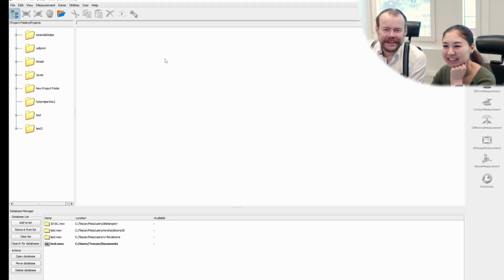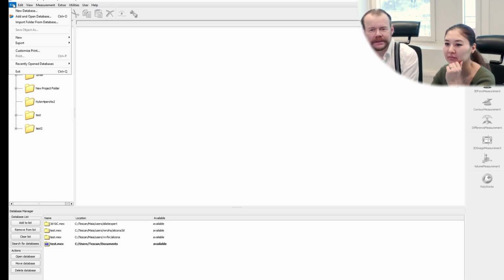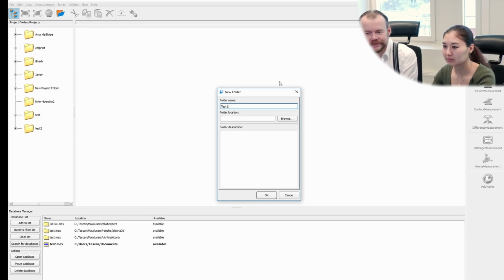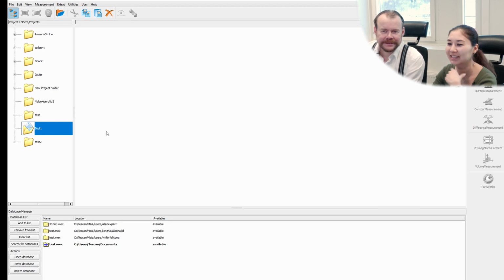All right, you can make a new folder here. I think, call it something. And you can go into that folder. Everybody tends to call them test, I think.